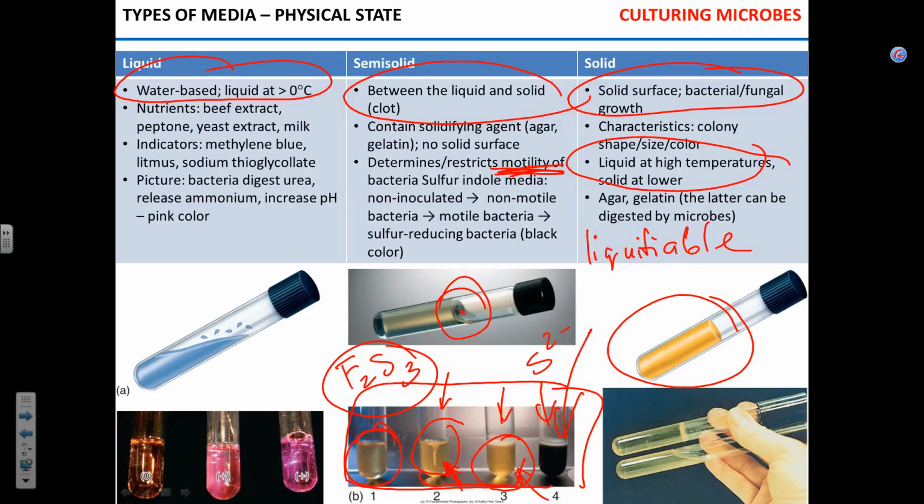Fats. Water. It's kind of a tough task. Forgot about something else. Protein. Well, not protein, but amino acids. Just supply them with amino acids. Some of them will need vitamins. So you can measure exactly, well, salts and stuff, but you can measure exactly all the chemicals that will support the growth of the microbe. Such medium will be called defined.